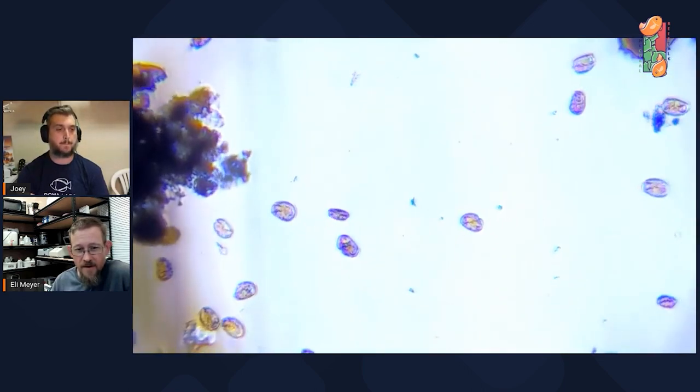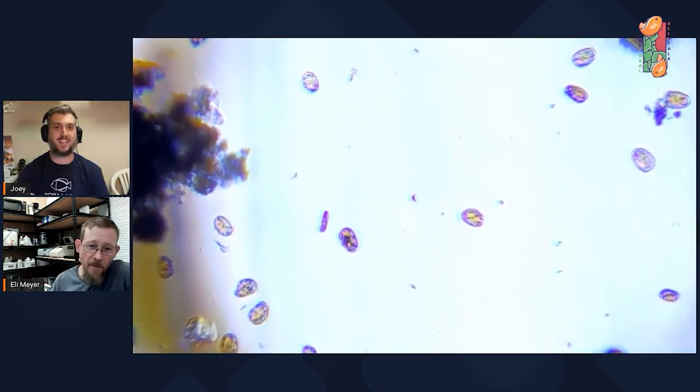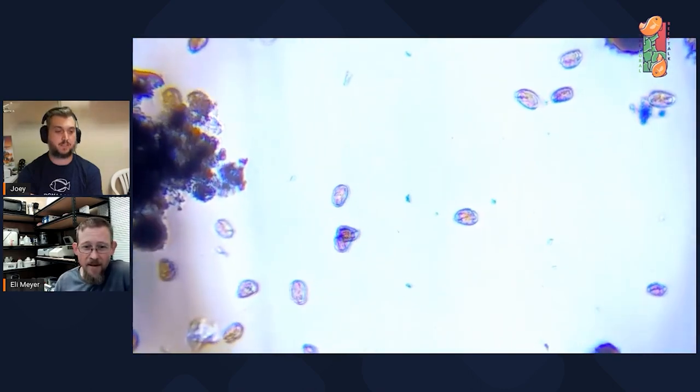I'm much better at interpreting DNA sequences than microscopy, but at a DNA level it certainly looks like amphithinium, along with diatoms — which we often see in nuisance algae situations. It's often not a pure culture of a single thing causing the problem in your tank; it's often a mixture and combination.